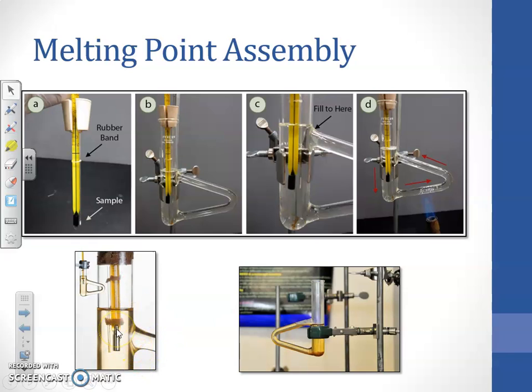I have given the video showing how to fill the substance into the small fine glass capillary, and how to attach this filled capillary to the thermometer. The animation is already given, you can see that. I am just going to explain the assembly here. First, we have to arrange the clamp stand attached with the Thiel's tube filled with the liquid paraffin.